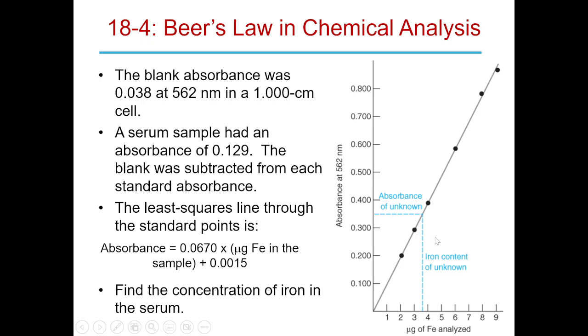This is the absorbance. These are your standards right here. Notice they're a little off the line because there's always error, right? Interestingly enough, this actually looks like it might be curving this way, which is what we were talking about. And notice this is at the 0.9. So it makes me wonder if they did the next one, if it would be like here. And that's the end of your dynamic region. But whatever, right? Obviously, this is a good Beer's law.